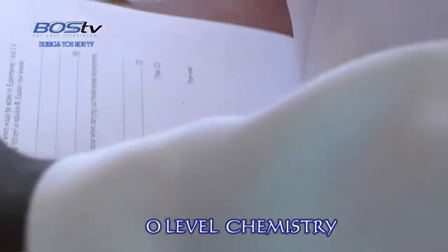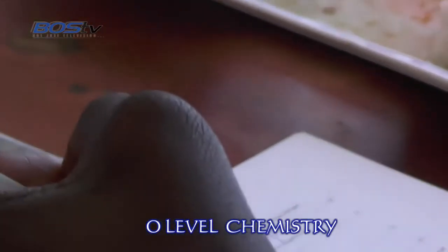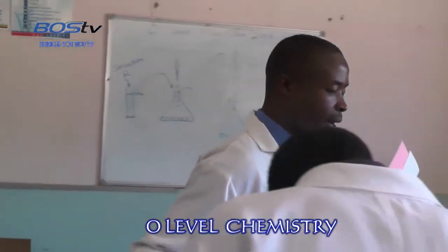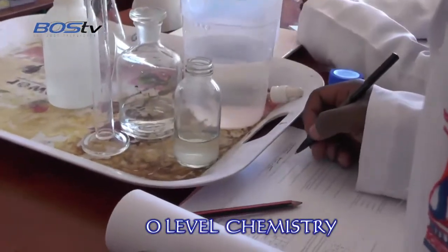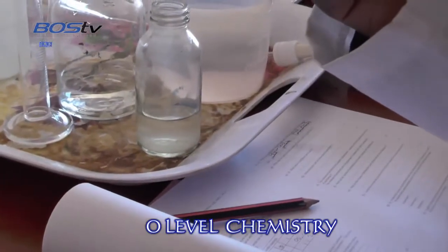Then what was the color of the indicator at the end of experiment 2? Write down the color at the end of experiment 2.